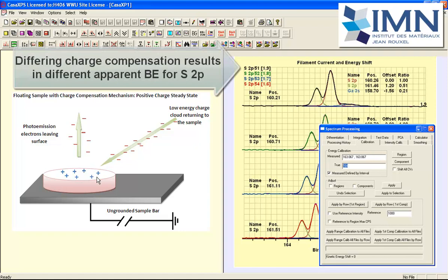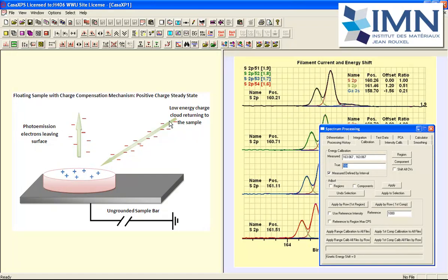Peaks would shift in binding energy. In order to measure from an insulating material we have to provide some compensation mechanism where electrons and also potentially positive charge is returned to the surface in order to maintain a balanced charge at the surface during the acquisition of a spectrum.